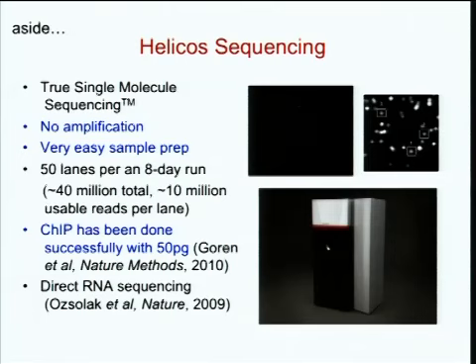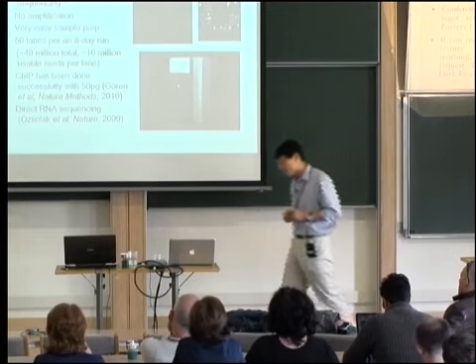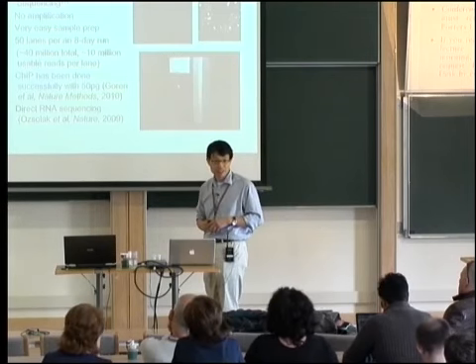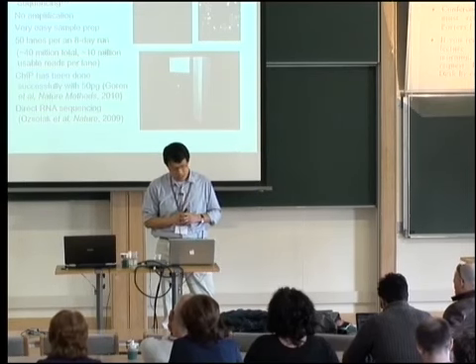And you can actually do ChIP sequencing with very small amount of material. Okay? Typical ChIP protocols will require something on the order of 10 million cells. If you're doing some ES work, some mouse work, you can barely get like 10,000 cells. Okay? So this is a huge issue. And so the fact that we can do this with a very small amount of DNA is important. Now, it's got lots of problems as well, and one of them being because there aren't too many machines available, it's unreliable. Sometimes it gets broken, and it's hard to get it fixed and such. But this has been great for our work.